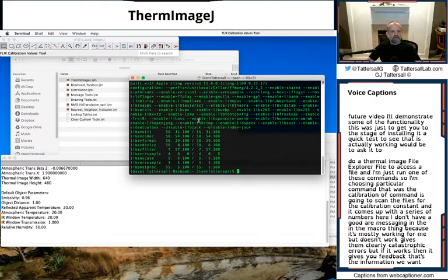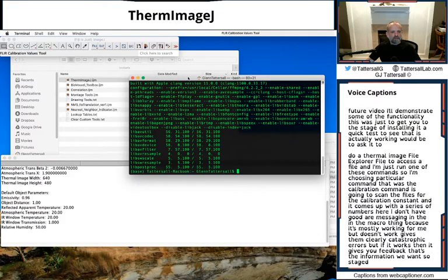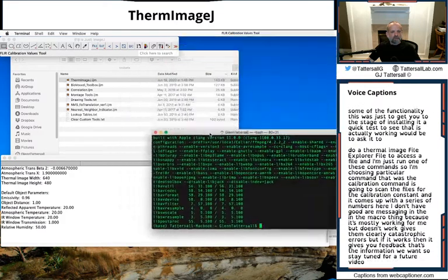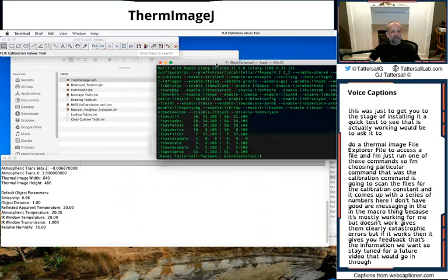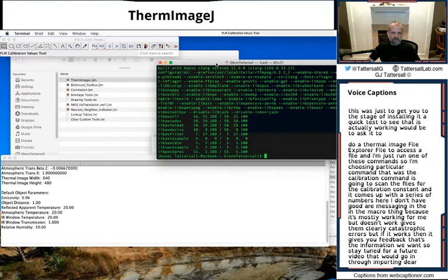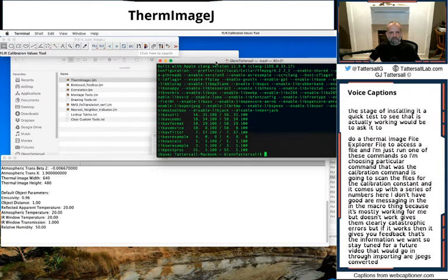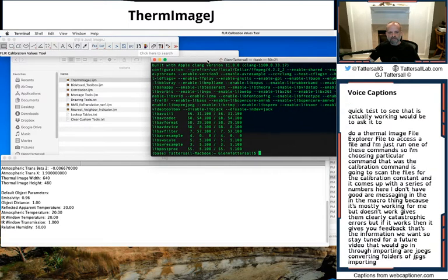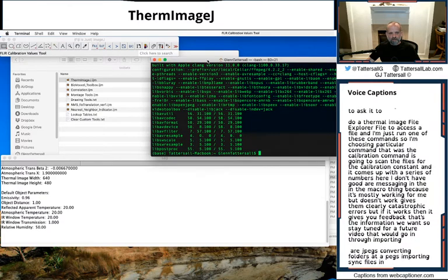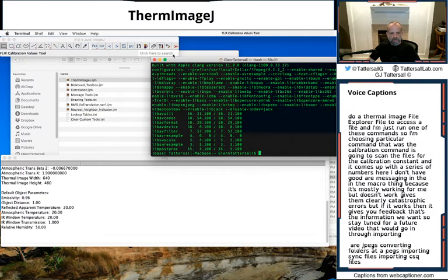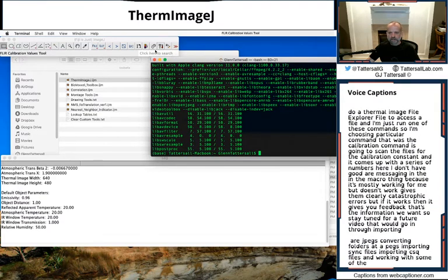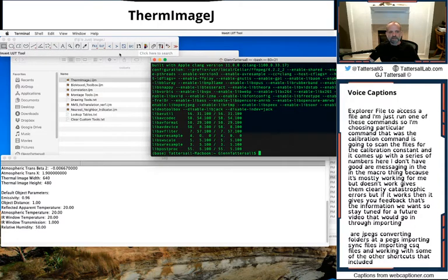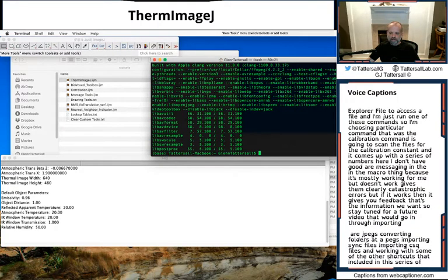So stay tuned for a future video. We'll go in through importing FLIR JPEGs, converting folders of JPEGs, importing Seek files, importing CSQ files, and working with some of the other shortcuts that I've included in this series of macros. Thank you for listening.